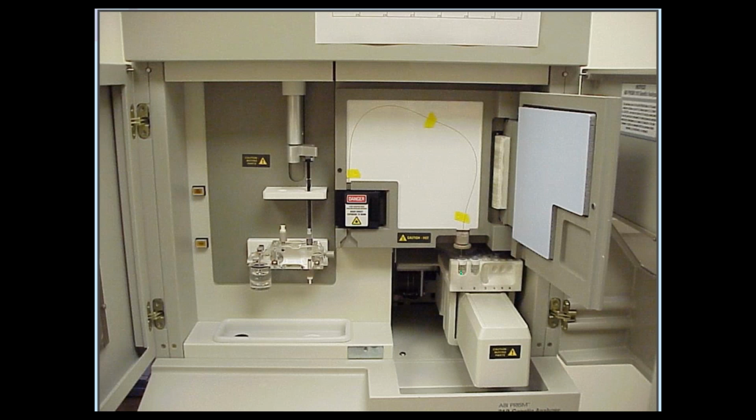Here's a capillary. It starts in liquid here, and there's also an electrode going in there. And then the capillary runs, do you see it? Like here. And it goes through this detector window. So you're essentially racing your DNA through this capillary and seeing how long it takes to hit that detector window. Okay? The smaller the DNA, the faster it goes and the shorter time it takes to hit that detector window.